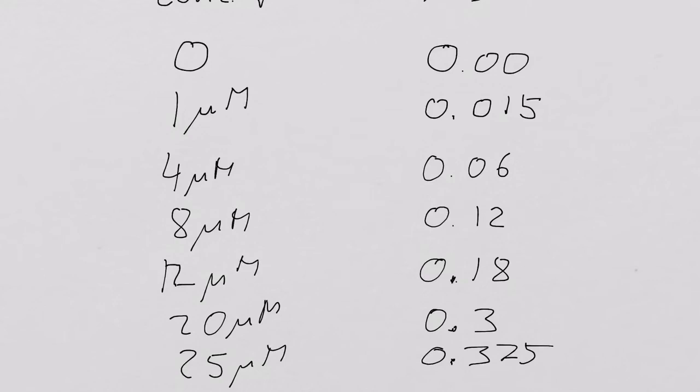Are our readings all right? Is there a dodgy reading in it? Is there anything above 1? No. So, hallelujah, it's okay. Yeah? So we don't have to worry. If it goes over 1, what did we say we need to do in this case? Dilution, exactly. We have to dilute it so that it goes below 1. Absolutely right.